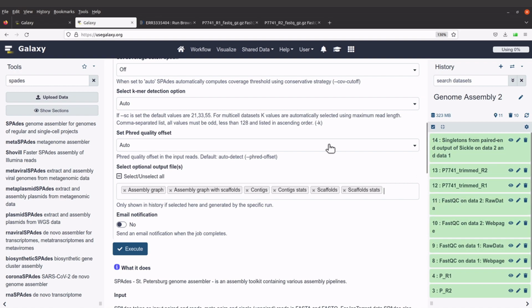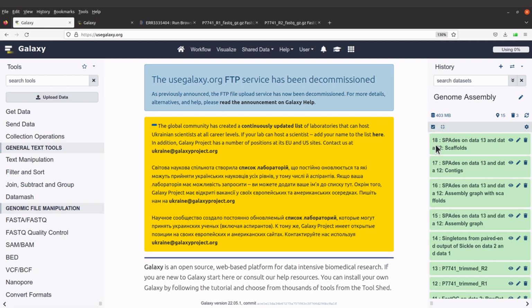Now after genome assembly, you can perform quality control. You can use tools like QUAST. So QUAST performs some analysis, and then you can use that to assess the quality of your assembly. So you have N50, you also have misassemblies. There are a number of things you can do as well. There is a lot of information you can get from the QUAST analysis. So I will encourage you to check that tool out.